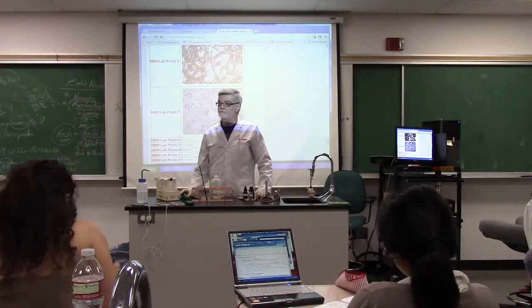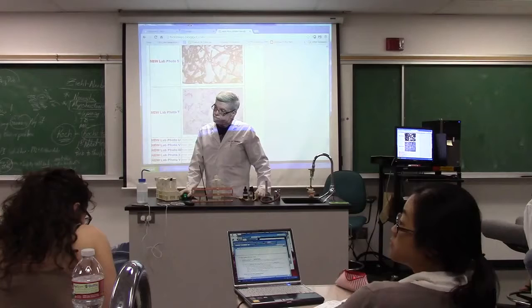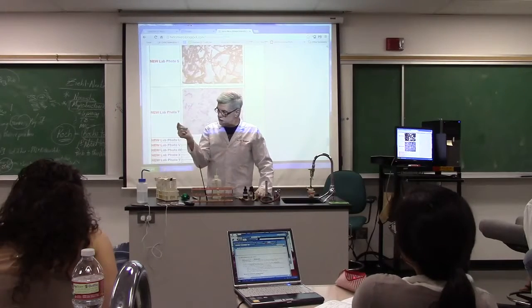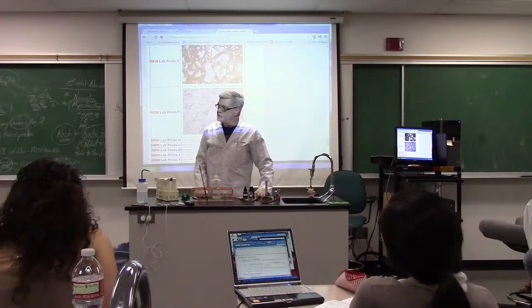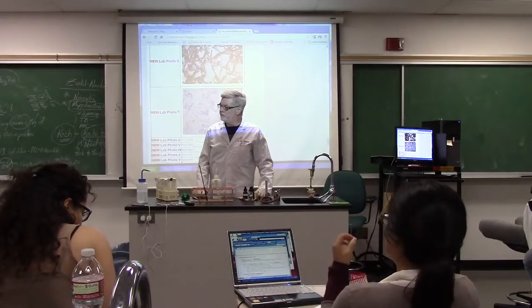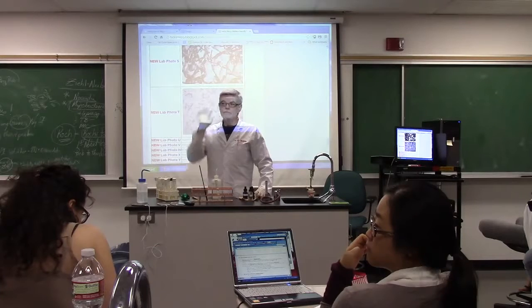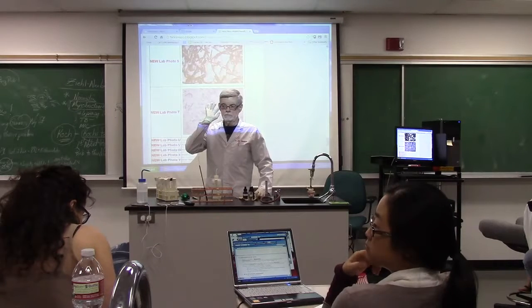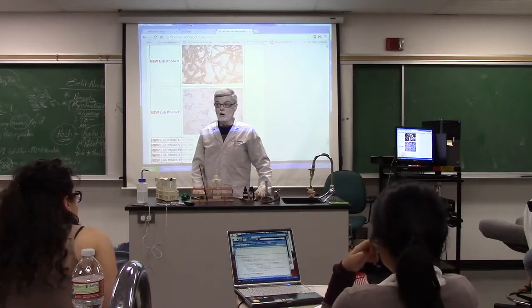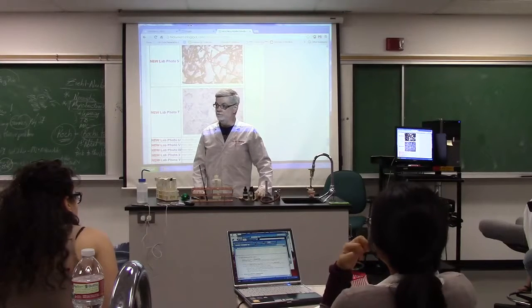Anybody have questions about this process? Anything about it? Yeah? When you made the smear, did you go out the slide? Yeah, I spread it around, but I made sure I smeared some of those clumps right in the circle, even though after I beat them, you could still see them. They look like little fibers. You had another one? Quick question. If the cells are hot pink, it's positive, right? If you have a hot pink rod, it has to be a rod. If it's a circle, it's overheated, or it's an endospore. It has to be a rod.